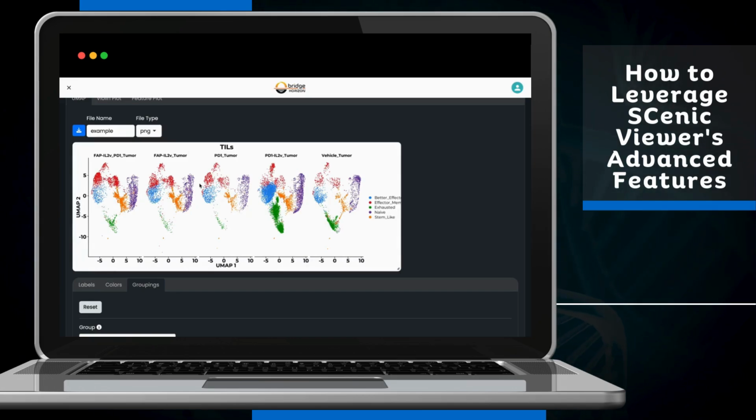Now, as you can see from the different treatment statuses, there is a cell population of interest that's potentially expanded within this treatment.